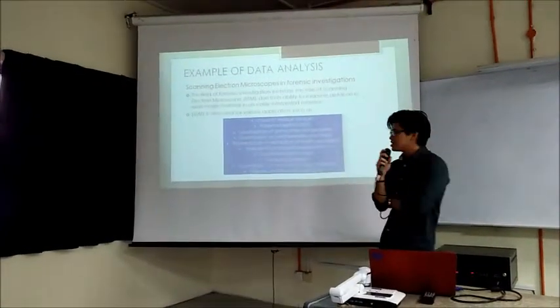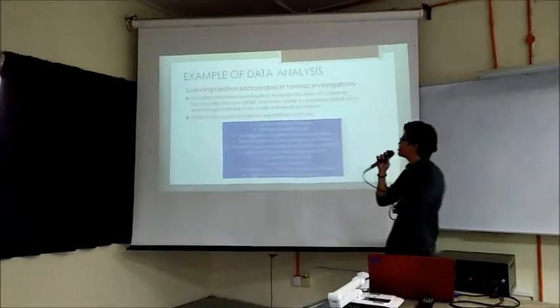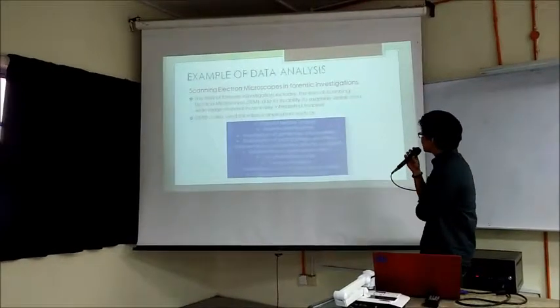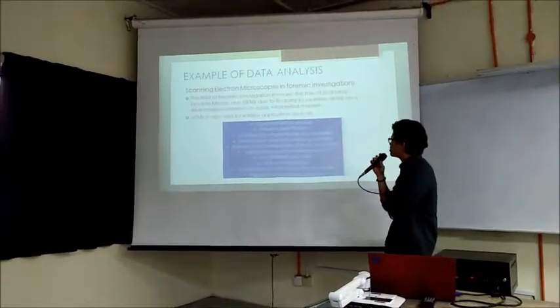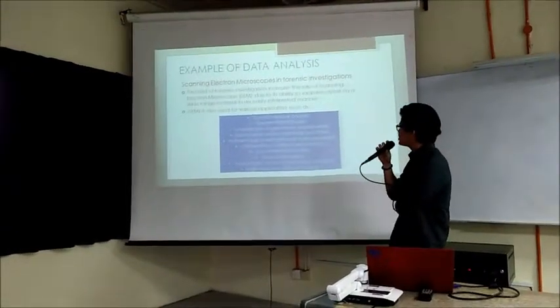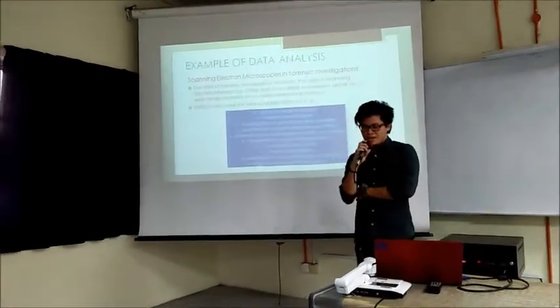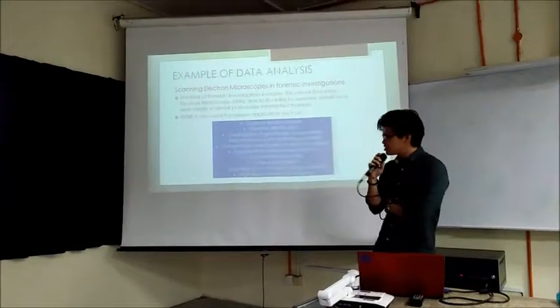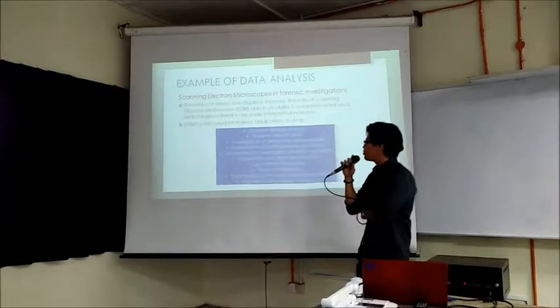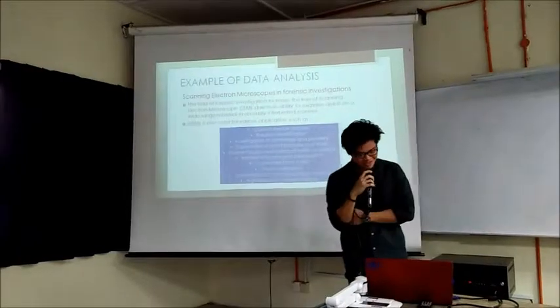One of the data analysis that we found is in forensic investigation. The field of forensic investigation increases the role of scanning electron microscope due to its ability to examine detail on a wide range of material in an easily interpreted manner, which means that the existence of electron microscope helps the forensic investigation to be better.